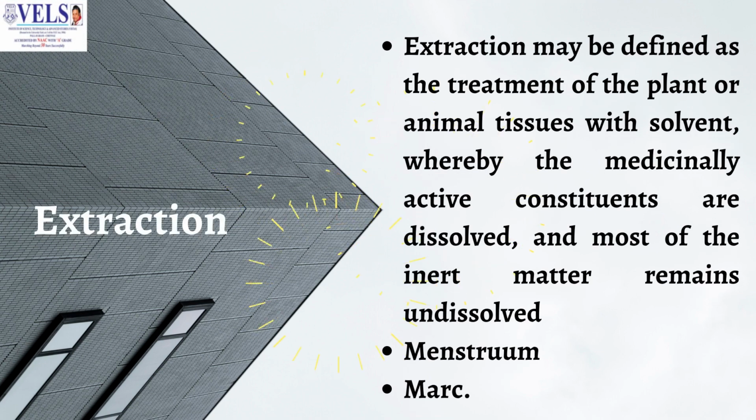Plants have been used as medicine since ancient times for the treatment of various diseases in human beings, and the phytoconstituents present in the plants are responsible for all the pharmacological effects. So these phytoconstituents can be removed from the plant materials using the extraction method.